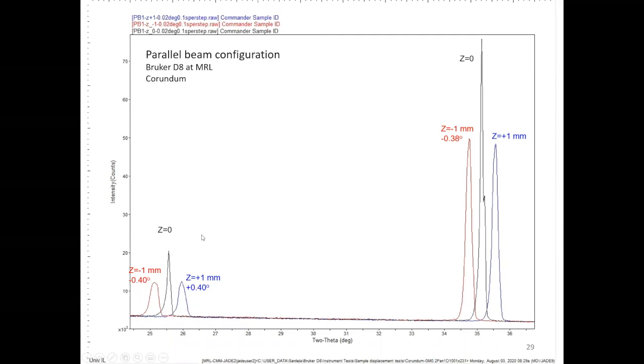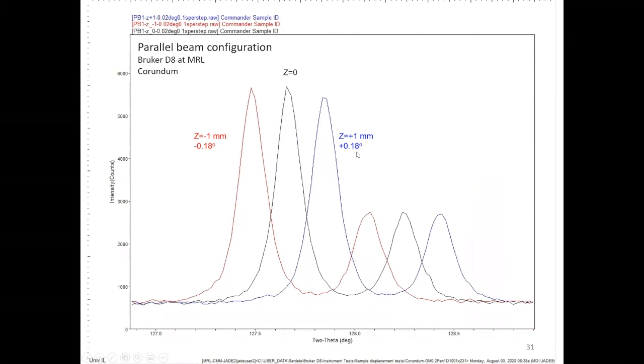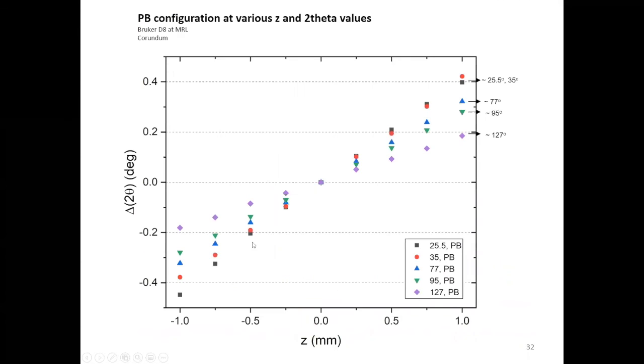Number 3, okay, data collection settings. People complain, well, my data is very noisy. I collect data and I try to do quantification and nothing is coming out right. What is going on here? Now, you have to understand what is going on behind the data collection. Basically, you are counting photons, which is a statistical event.